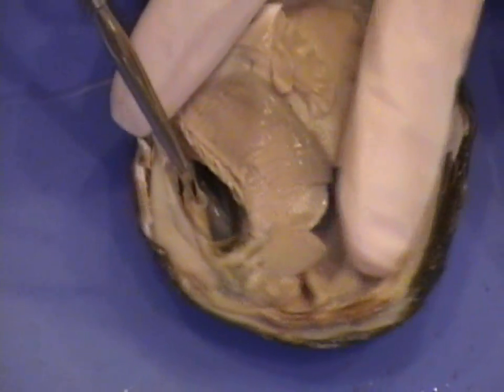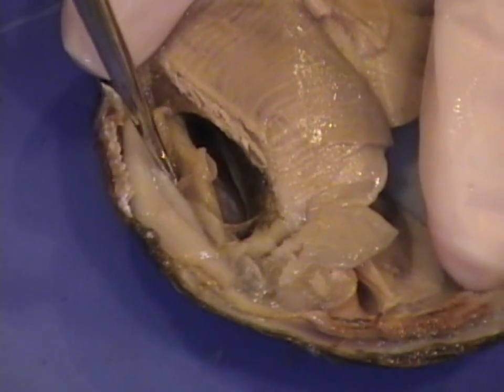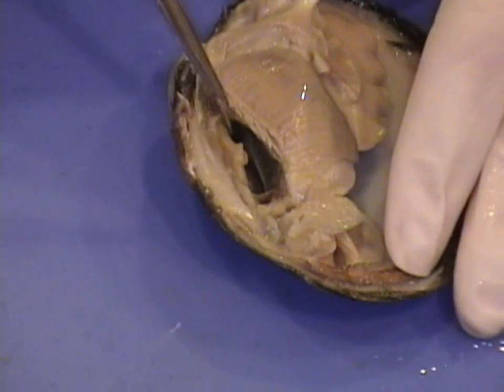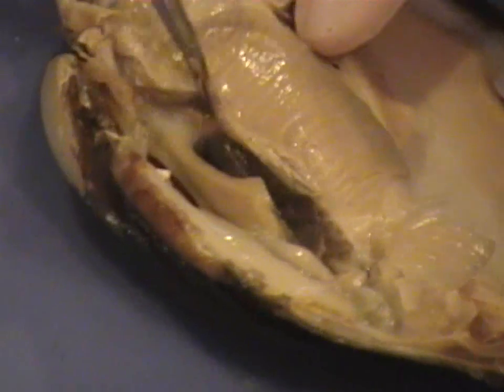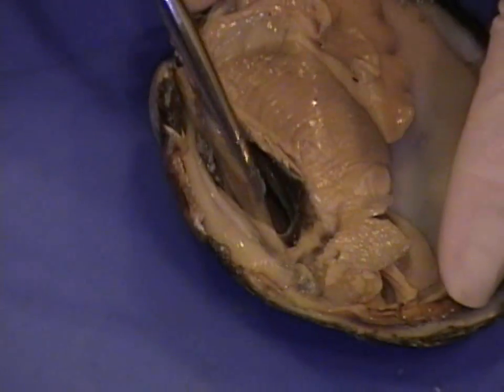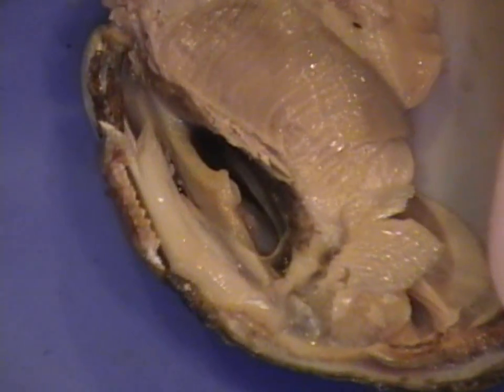There's a left and right auricle. Right now only one is visible. Then, just remove a little bit here. Underneath are the kidneys. Here's the other auricle. So here's the heart, which lies beneath the gills.